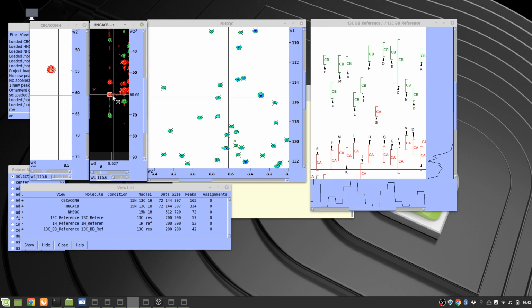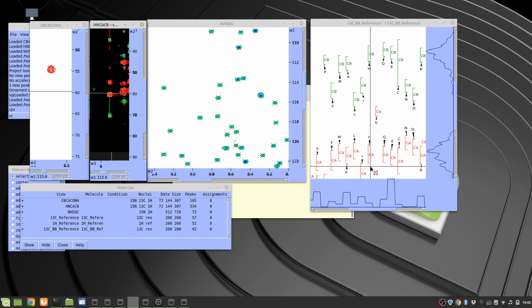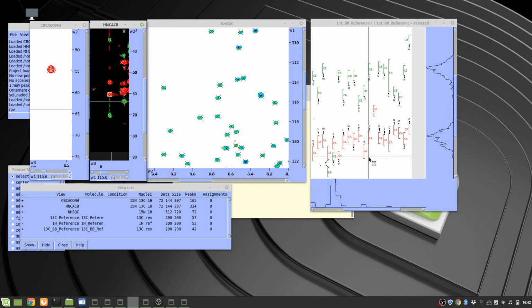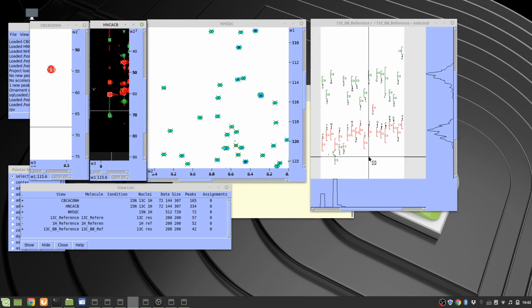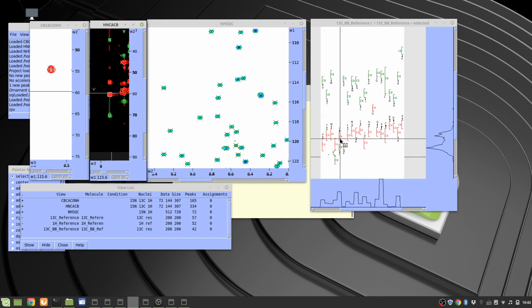So this one is I, because you don't see that signal in here. If you place your cursor on the exact same position like this, then you can see what the highest probable one is, as you can see, like isoleucine or serine, threonine, and so on. They will interactively change like this as your cursor moves.